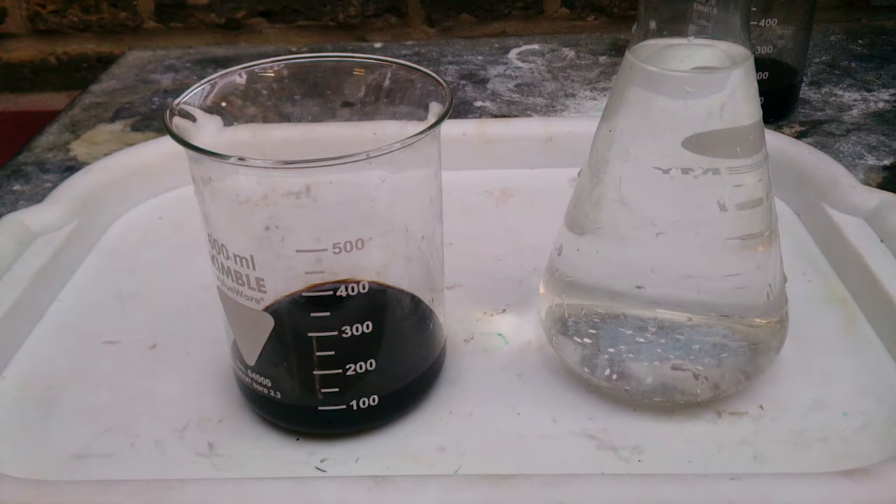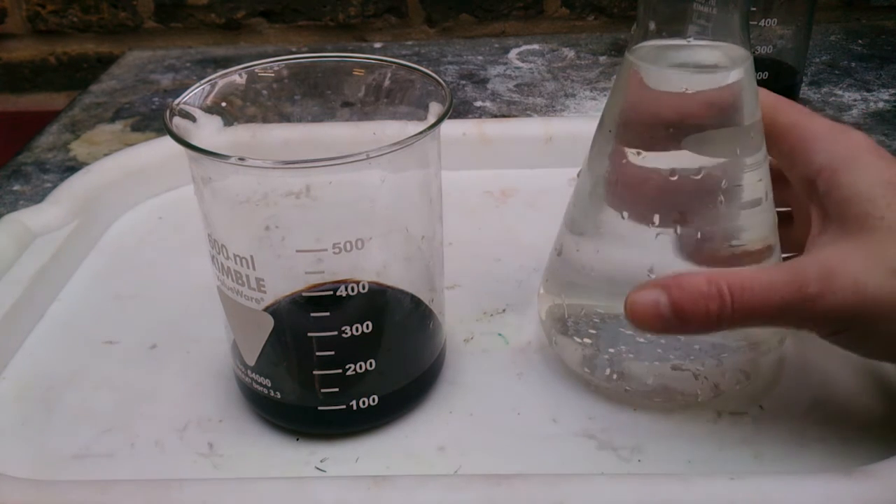When it comes to aqua regia, or any other type of gold-bearing solution, copper chloride may exist in two oxidation states: copper chloride 1 and copper chloride 2. And this is what I have — a quite concentrated solution of copper chlorides. It contains zero gold, but this is a type of solution you might get in real life.